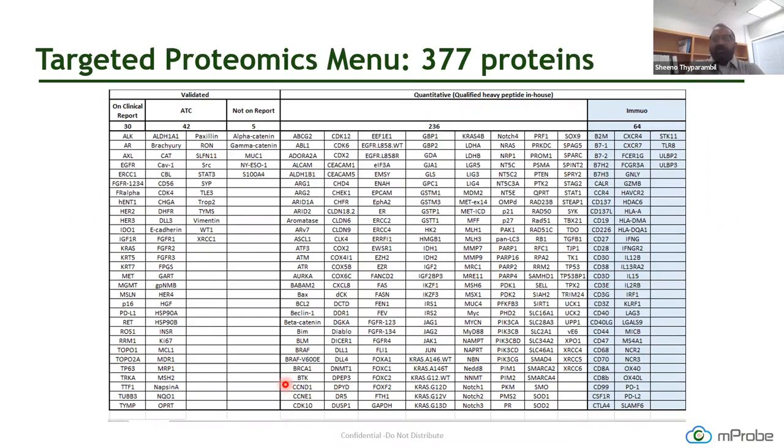That's a great question. This is a favorite question, but in general, what we say is the way we do laser microdissection, we try to get as many spots as possible and kind of average that heterogeneity out. We call it the elevator experiment and the onion experiment, right? Where we are peeling off different layers of the onion, and we can see that when you're moving in a transverse plane, you really do see some heterogeneity. But when you're going down a tissue, one section after the next section and the next section, we have put out papers. Actually, there's not that much difference that we tend to see, at least in the biomarkers that we examine.